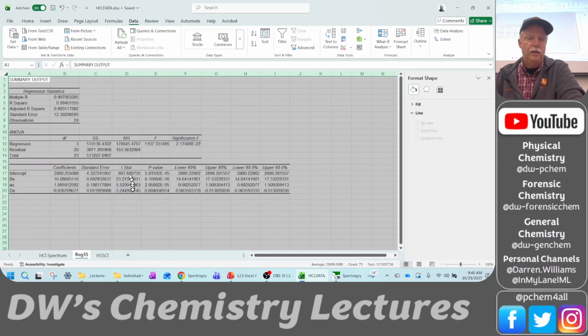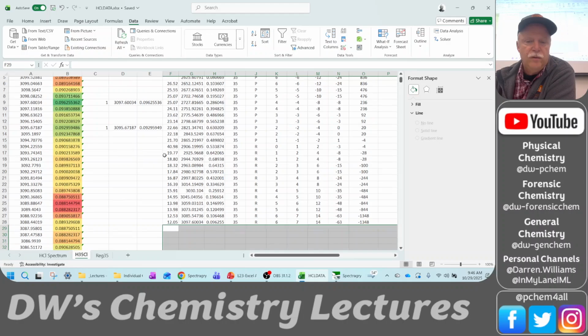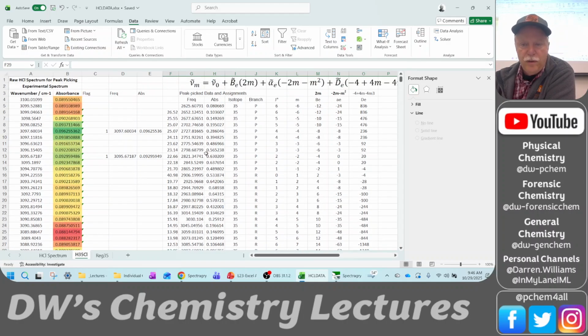Okay, great. Doesn't look good at all. So what is it about this that doesn't look good? Well, the R squared should be way better than that. Look at the standard error in our vibrational frequency. And these are our p-values, and this is saying the centrifugal distortion constant's not statistically significant. So something's wrong. Gotta be.